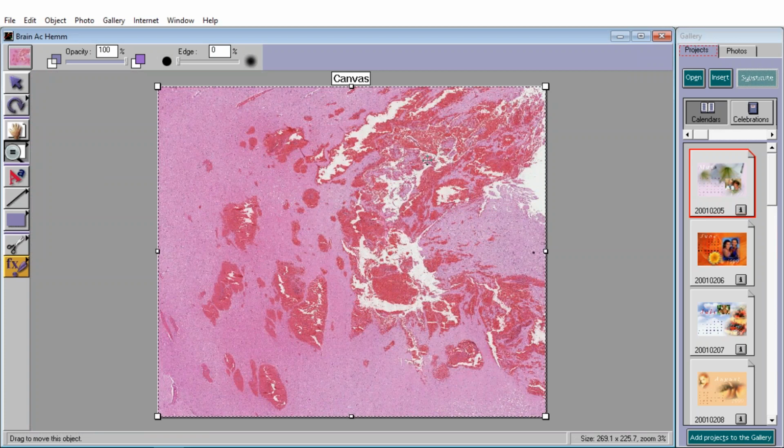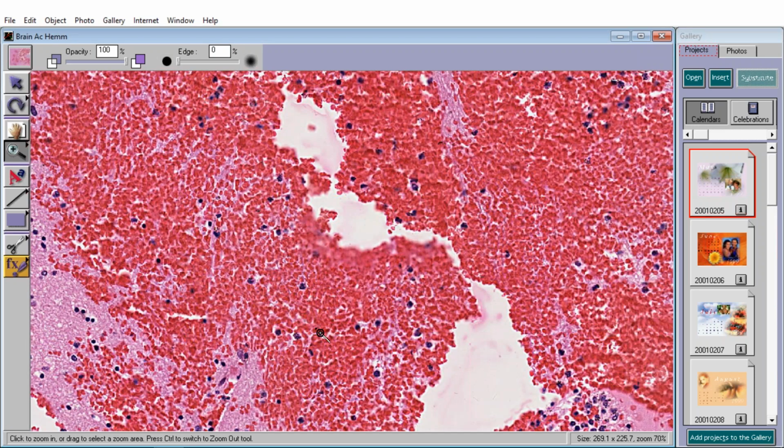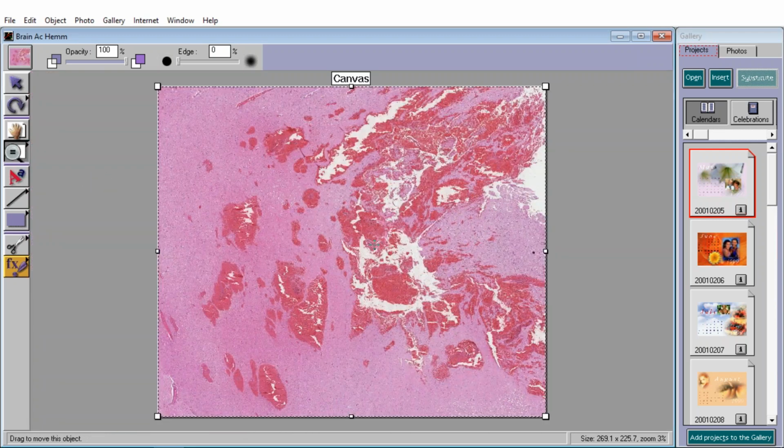What does that mean? Well, it means you're being honest, okay? And why am I saying acute hemorrhage within the brain? I'm saying acute hemorrhage within the brain because when you look at it, it's basically still mostly just red cells, okay? It's acute blood. If it was chronic hemorrhage, these brain cells may have been broken down and the blood pigments eventually chewed up by the macrophages, and you would see pigmented cells with hemosiderin as chronic hemorrhage. But we're going to call this very correctly acute hemorrhage within the brain, period. Okay, we're not going to get fancy. We're just showing you basic patterns of disease here.